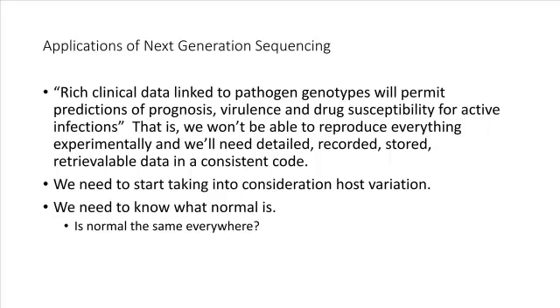And we need to be able to collect this in a standardized manner. It needs to be deposited somewhere, so multiple researchers, clinicians, and practitioners can go back and search that data, add to it, and try to slowly chip away at understanding new diseases and viruses that may be showing up in pigs.